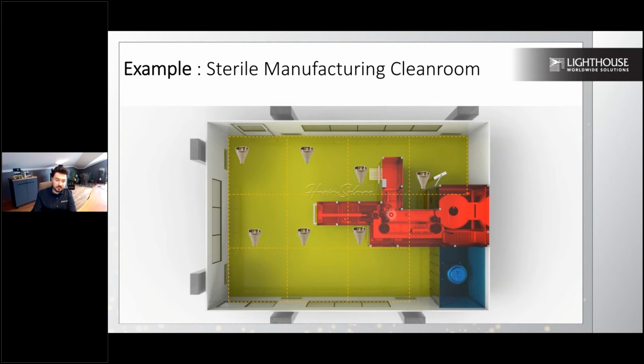I'm having a sample in this location because this is a quite active location for me. All the microbiological sampling activity around this is going through these glove ports. So I want to make sure that even though this area is way smaller than the other locations, I have one sample location at this point.